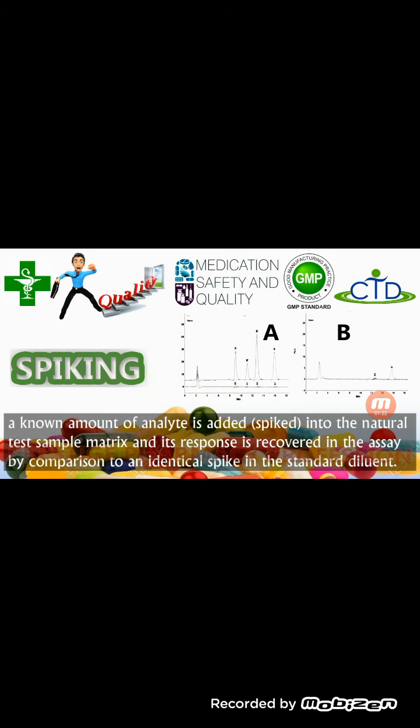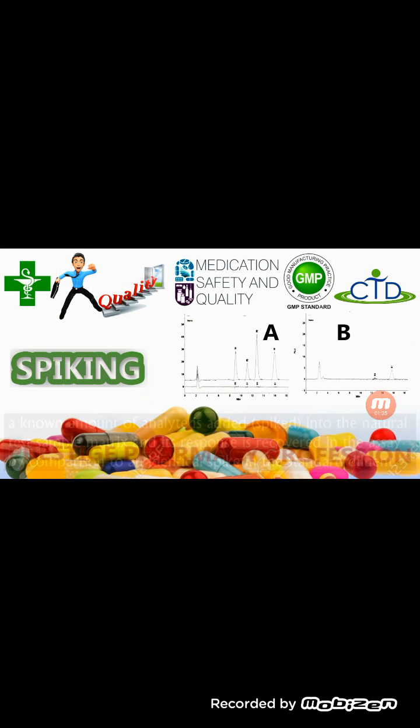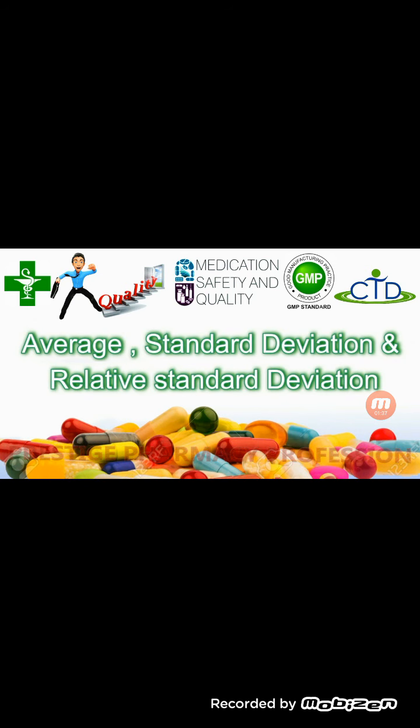Reading as desired. The diagram named B on your screen is representing the natural peak of the analyte before spiking, whereas diagram A is representing the sample after addition of a known amount of analyte in the testing sample. Average, standard deviation and relative standard deviation are statistical terms to calculate the closeness in the data. These terms are used to measure the characteristics of validation such as accuracy and precision.